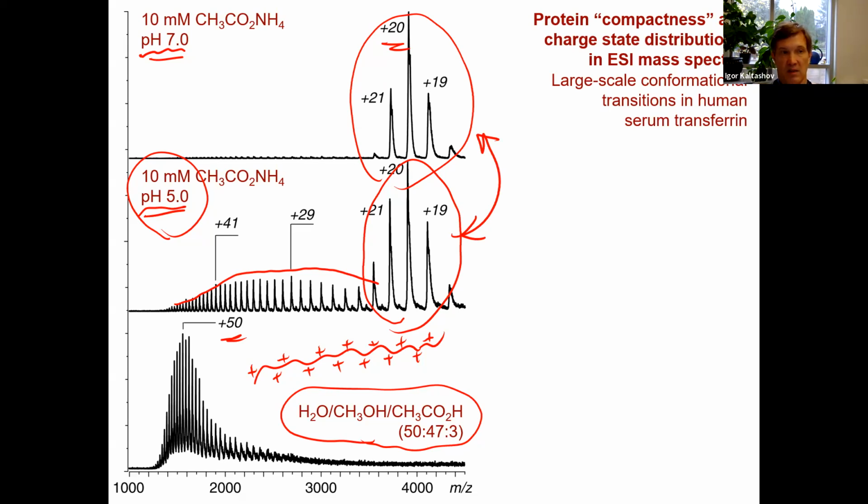So what happens at this intermediate pH, the protein just begins to feel unhappy, right? And a fraction of protein molecules begin to unfold. So this is most likely a reversible process. They spend some time in the unfolded state, then they would refold back. But the stability of this folded conformation now is compromised. And therefore, you see these partially unfolded species under these conditions.